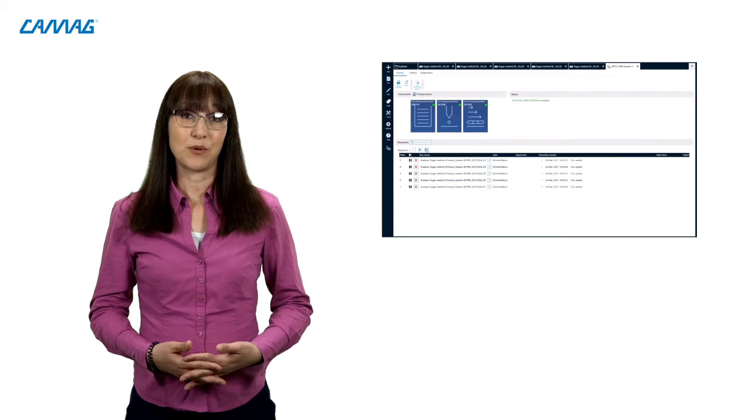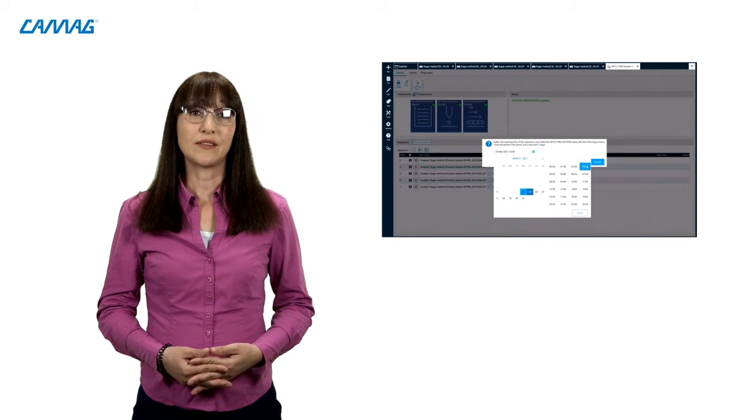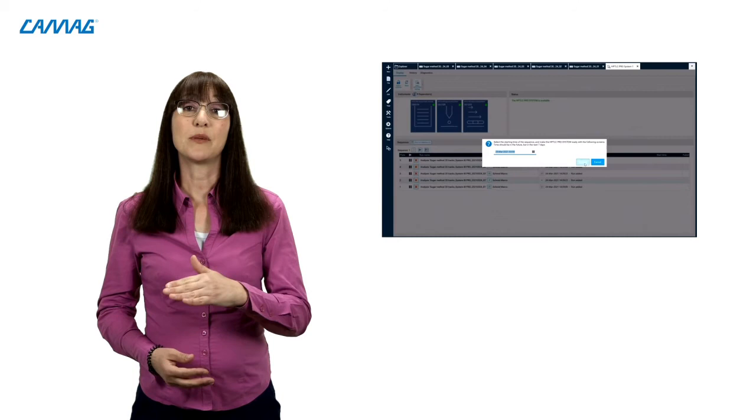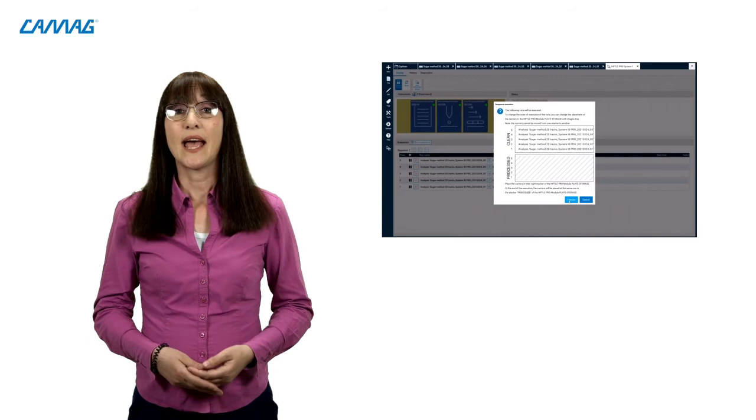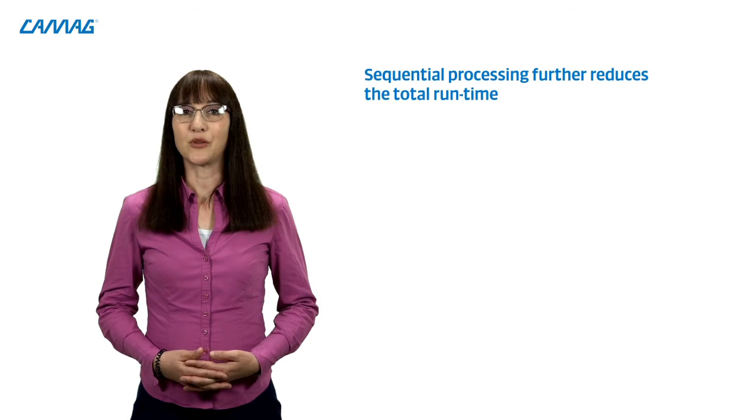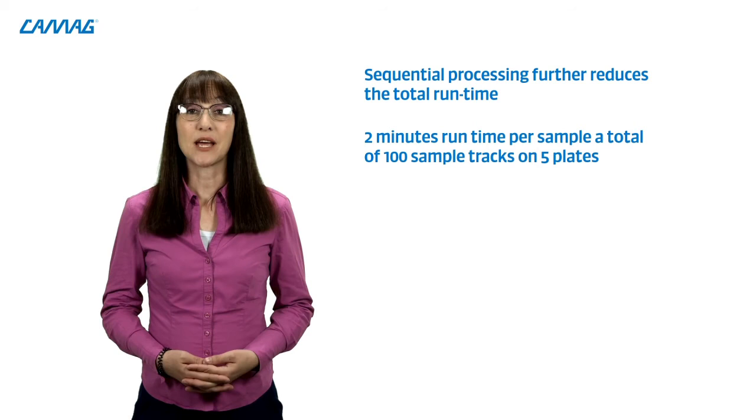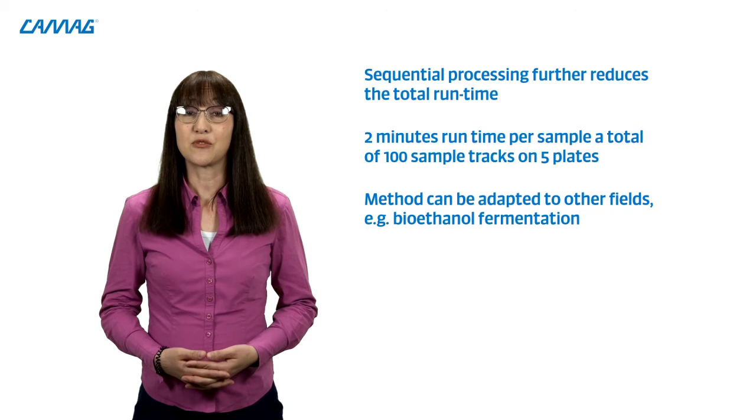And this is not the end of the story. The new method uses a simple isocratic development after plate activation by molecular sieve. Together with the module plate storage and the software vision kits, five analyses can be programmed as a sequence. The sequence allows an overlapping processing of the plates. While the first plate is applied and is moving to the development step, the second plate enters the system and is applied while the first one is developed. Start the sequence whenever you want, for example during the night, and get back to the lab ready to further process the five developed plates. When plates are processed in sequence, the total runtime of five plates is further reduced. For 100 sample tracks on five plates, we get a runtime of about two minutes per sample. This method can also be adapted for other fields, such as bioethanol fermentation and others. Pretty straightforward, I'd say.